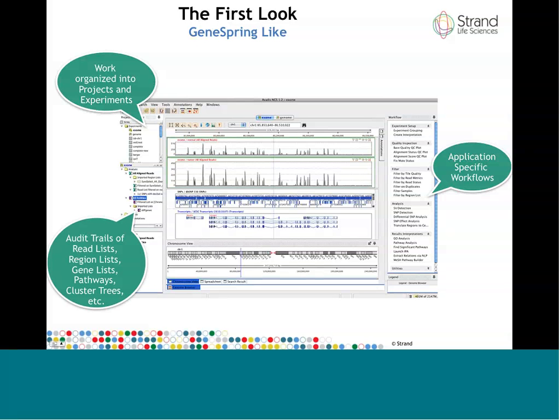On the left, again, you see various sections, each of which refers to a particular experiment that's open. Within that open experiment, you see a hierarchy of objects. This is the audit trail for that experiment, comprising various objects that you create as you do your analysis. To begin with, after you've just created the experiment, you'll have a single object called the all-aligned reads object, which comprises all of the reads that you've imported. As you run various filtering steps and analysis steps, more objects will get created.